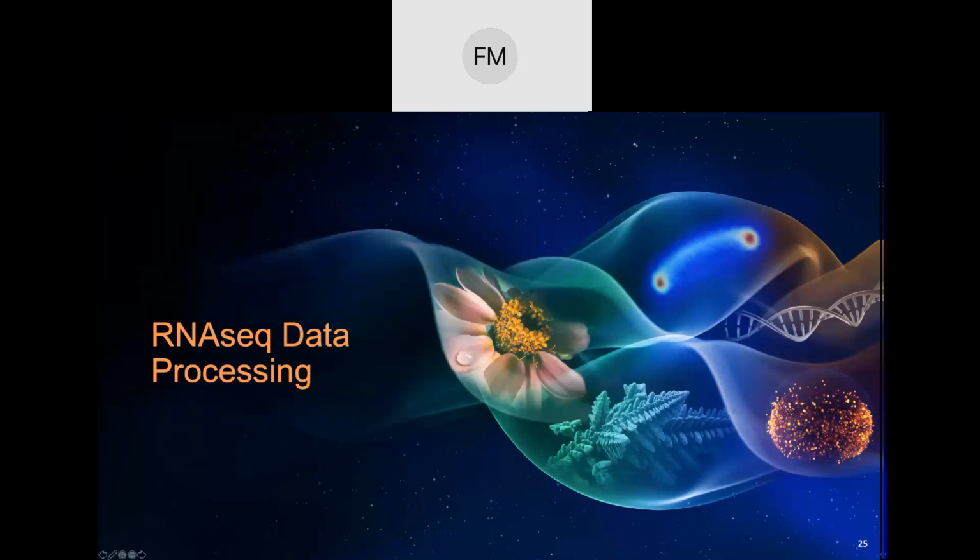So I do want to get through the RNA-seq workflow lecture until the end of looking at the quality of trimmed data. That way tomorrow we can start with a quick review and some information about strandedness, and then hop right into the start of the Jupyter notebooks. I have about another 20 to 25 minutes of lecture that I want to get through before the end of the day, but I know that I just gave you guys a lot. Do you want to take a quick 5-minute break before we get into the processing side of things? Yay, nay? I'm seeing thumbs up.